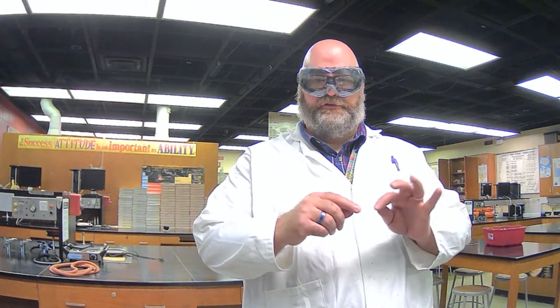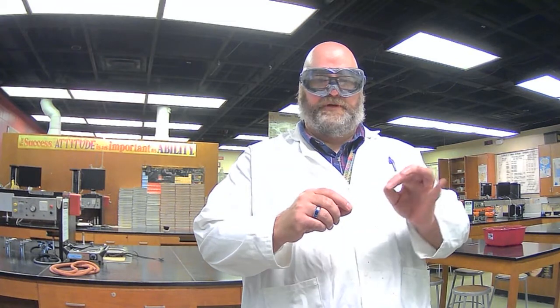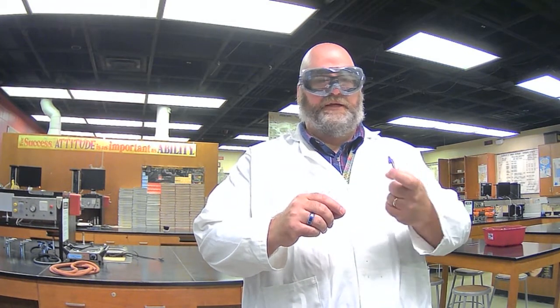So the first item we're going to be not measuring, but calculating, is the density of various irregularly shaped objects. Those objects are such that it's not easy to use a ruler or an instrument to measure the length, the width, the height, and so on, so that we can then use math to calculate the volume. Instead, because they're irregularly shaped, we're going to use what's called water displacement.